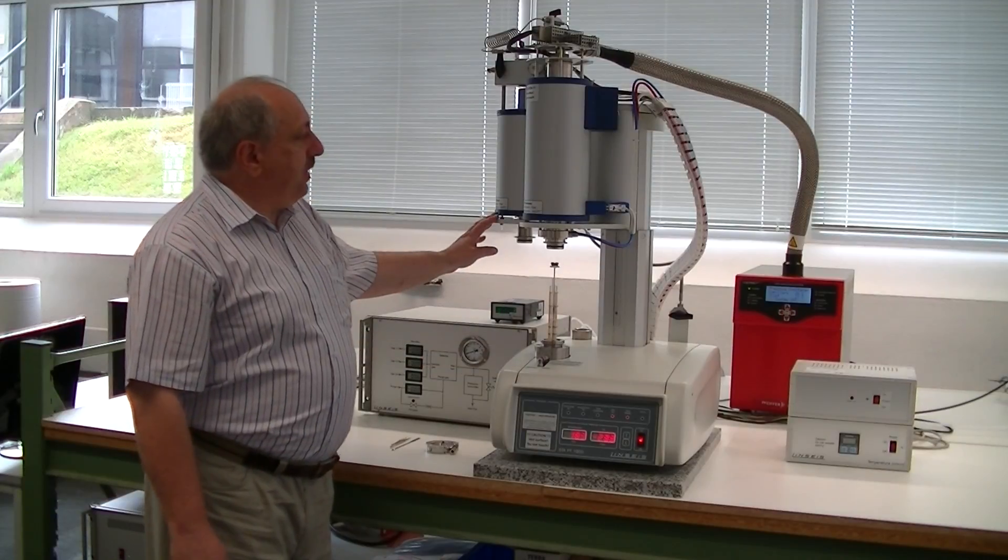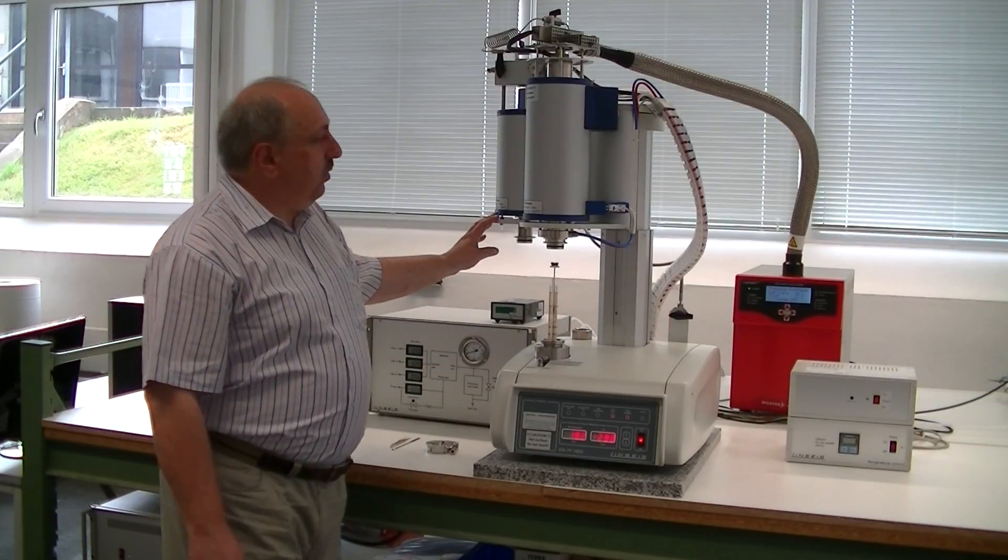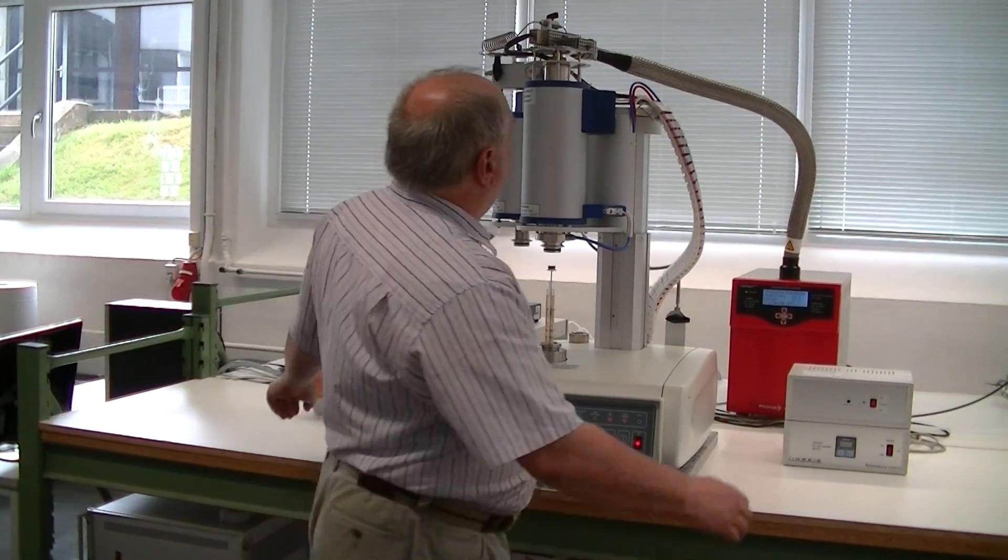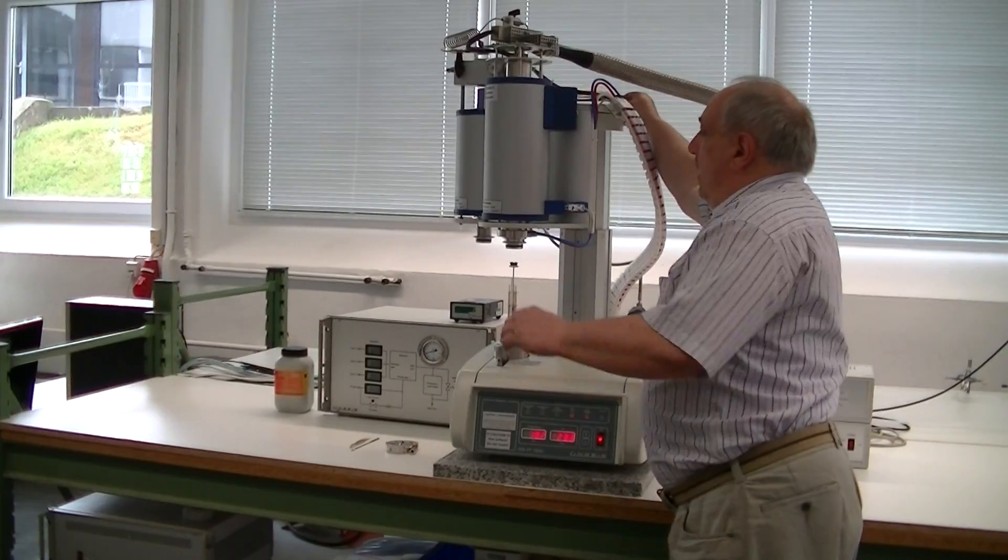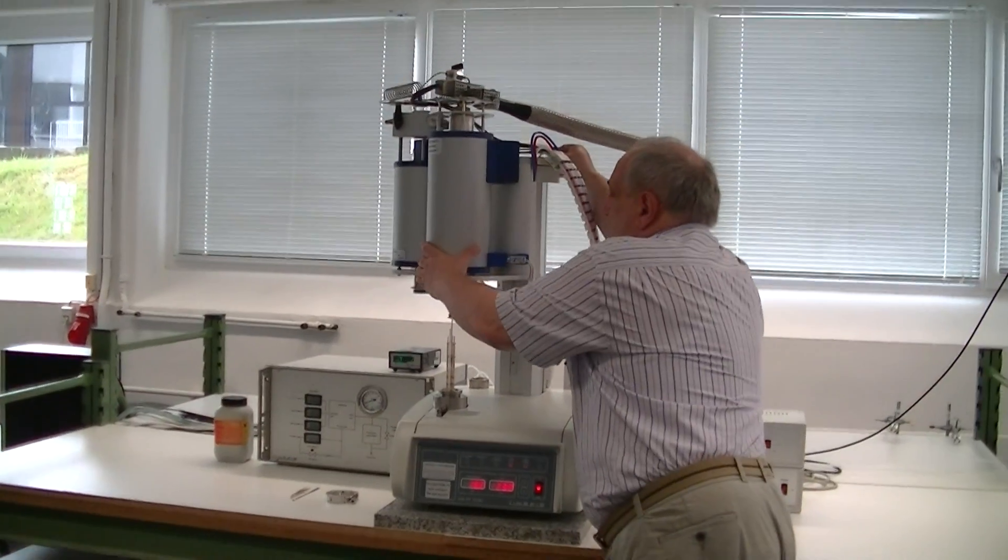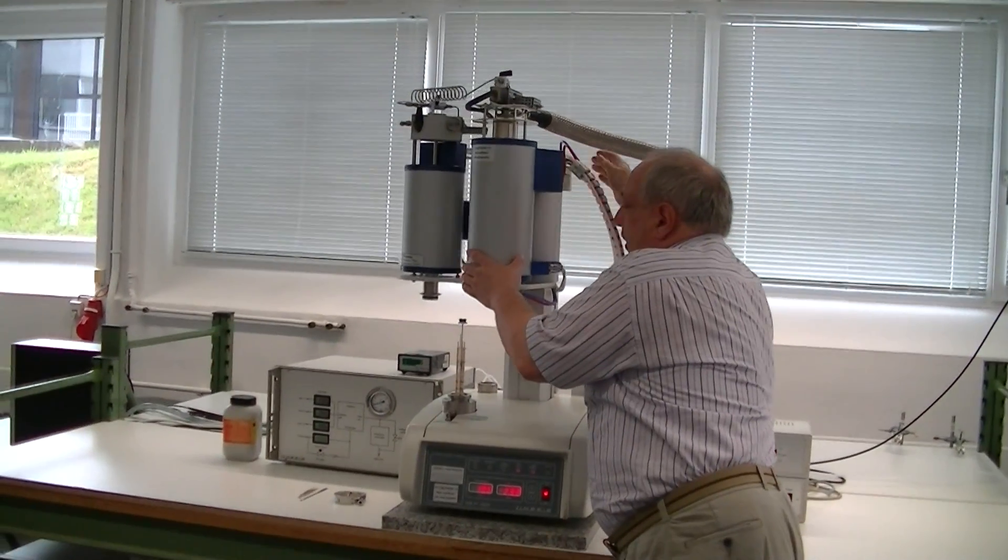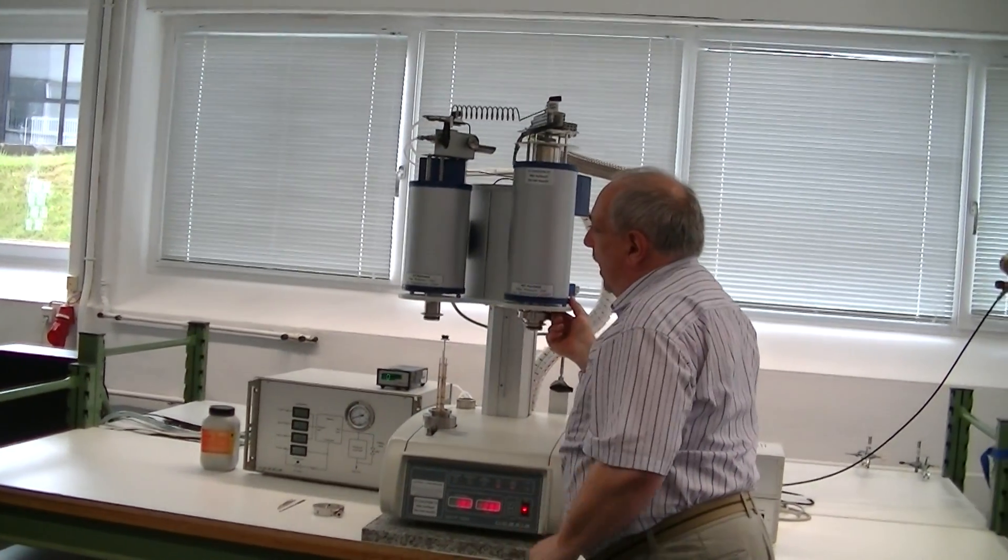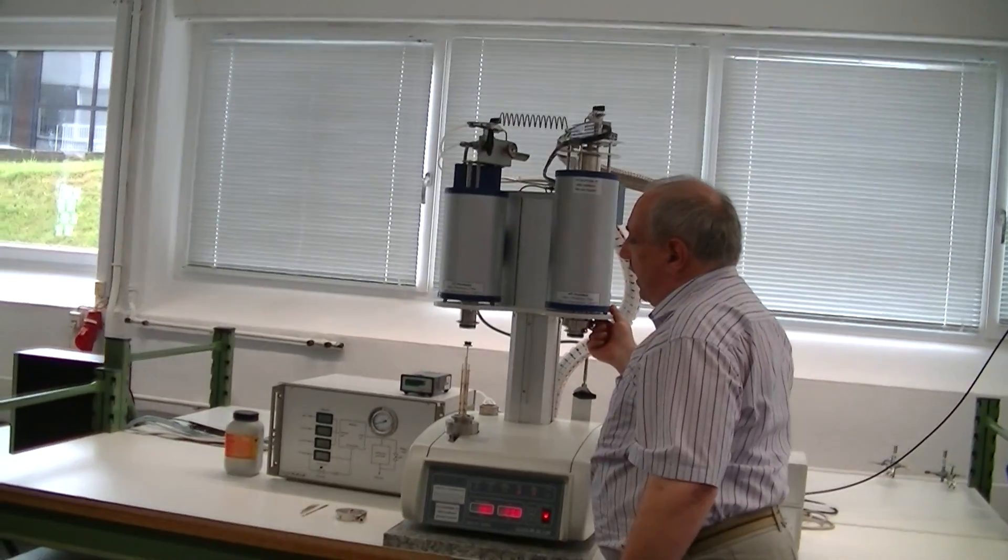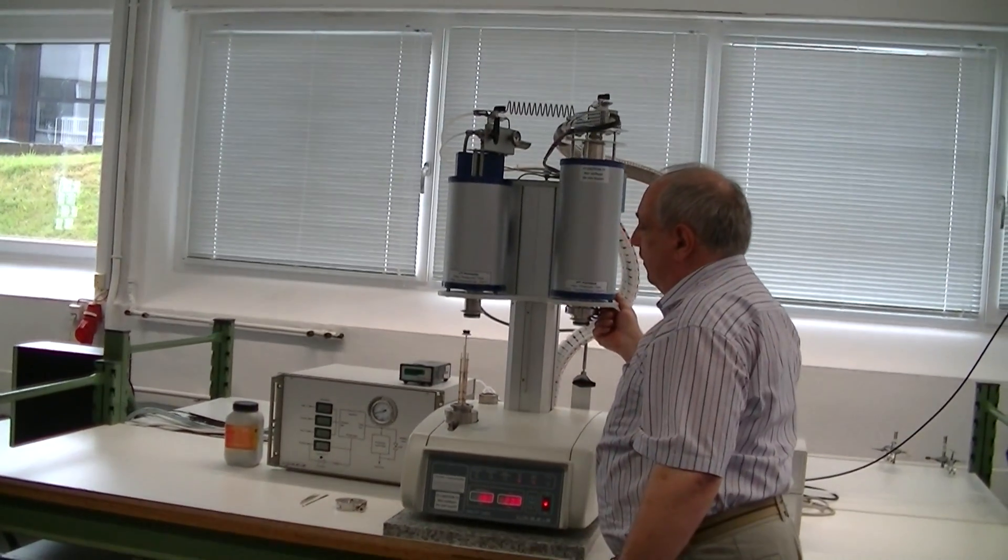To change the furnace, it is very easy. You only have to lift the button here and you can get the other furnace to the front and can work with the other furnace.